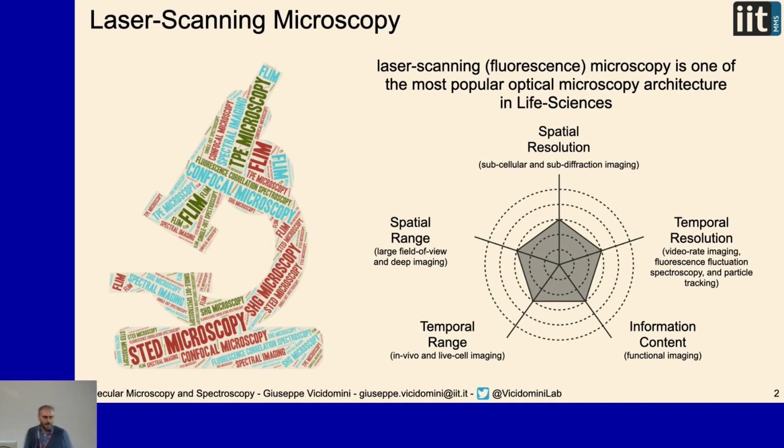Just to mention a few: with confocal microscopy, I'm sure everybody knows that you can achieve three-dimensional imaging inside your sample. Or today we saw a beautiful talk about two-photon excitation microscopy, in which you can use this excitation regime to go deeper in your sample. Or we can mention STED microscopy, the previous talk. Combining laser scanning microscopy with the STED principle, you can achieve, in principle, unlimited spatial resolution. Fluorescence lifetime imaging, which Alberto already mentioned, is fundamental for functional imaging. And I can mention many, many more.